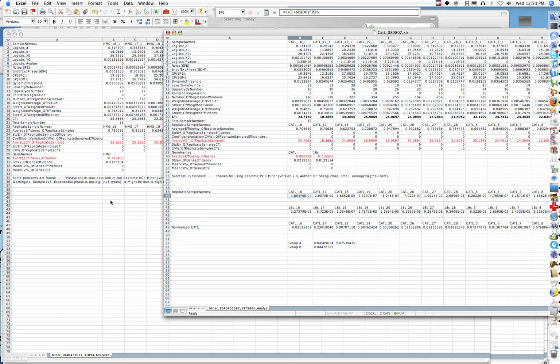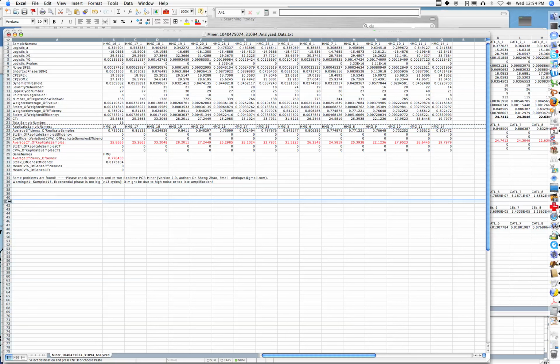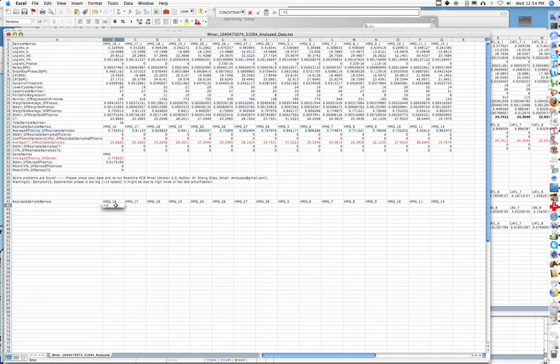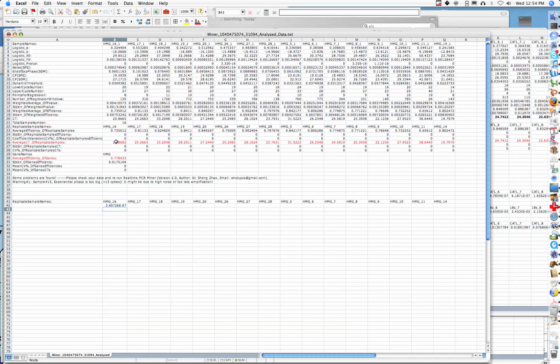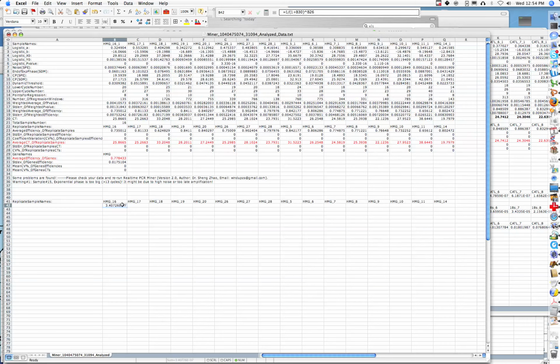So let's try to do that over here. Okay, then you simply anchor that in.